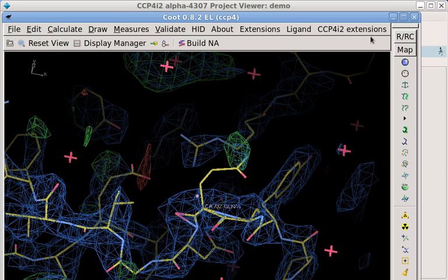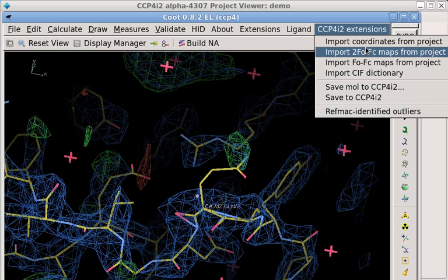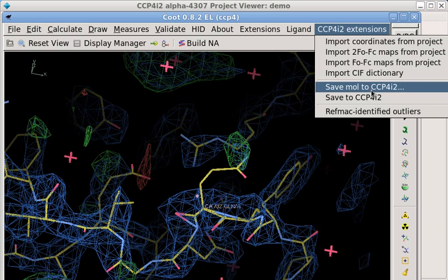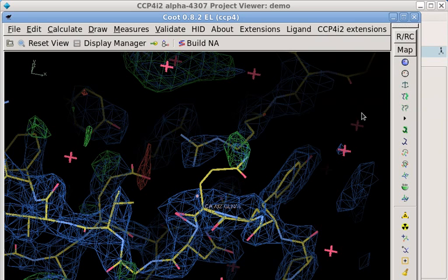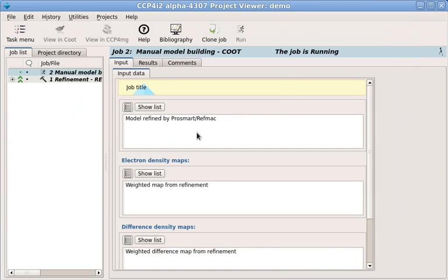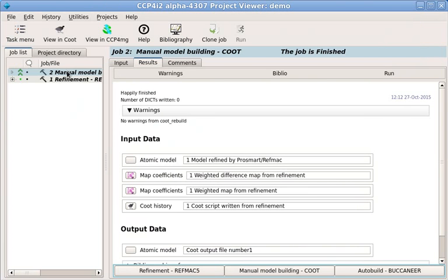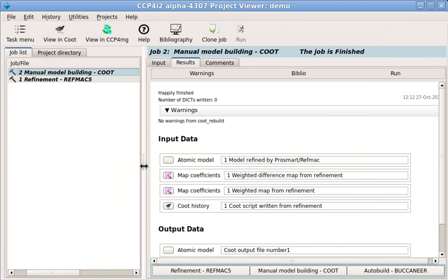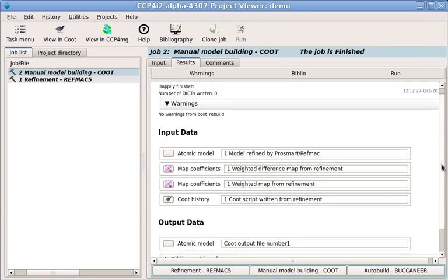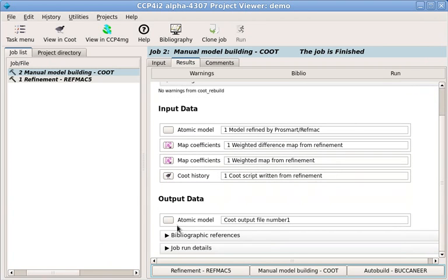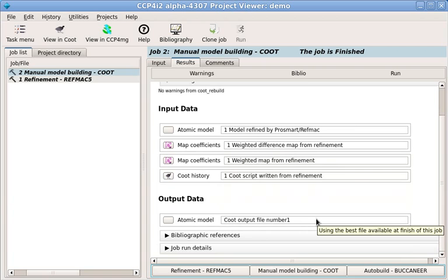This will ensure that our changes are recorded in the CCP4i2 database. Our Coot job has been recorded in the job list, so we have a full record of what we have done. If we just use Coot as a viewer and don't save anything, the job will be deleted from the list.